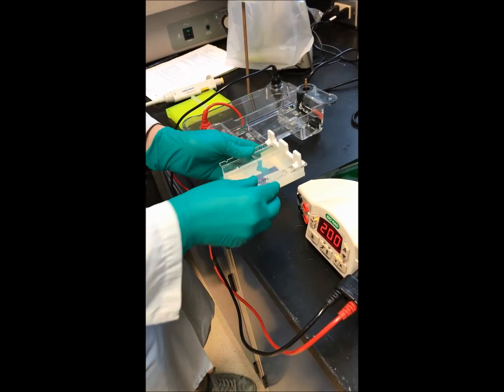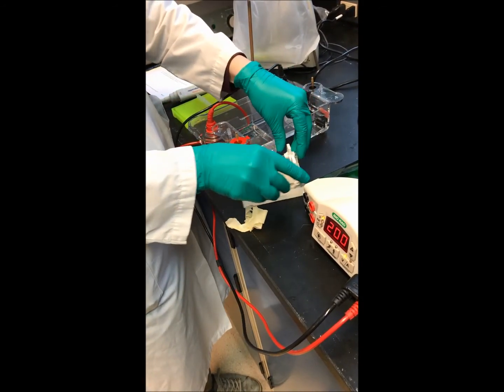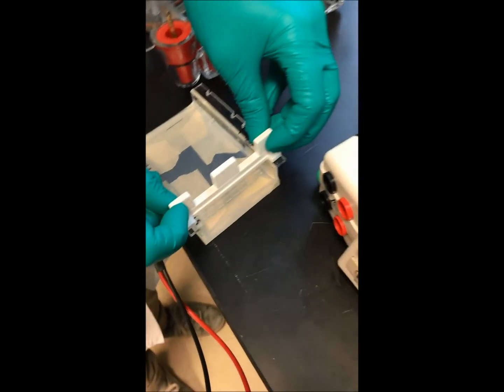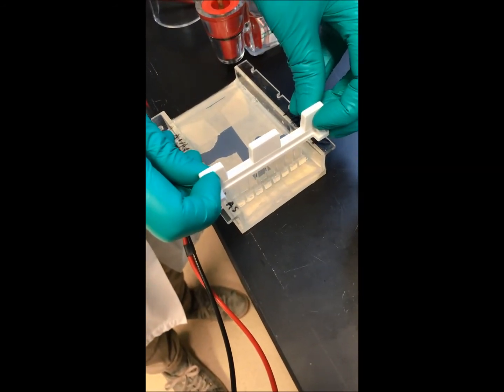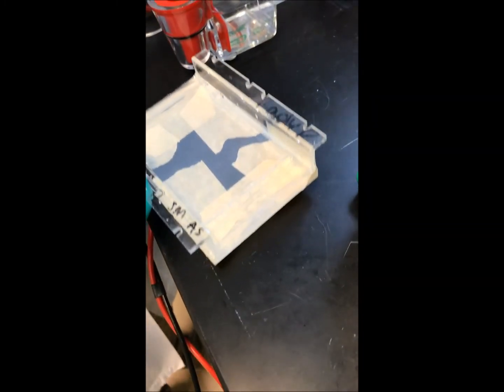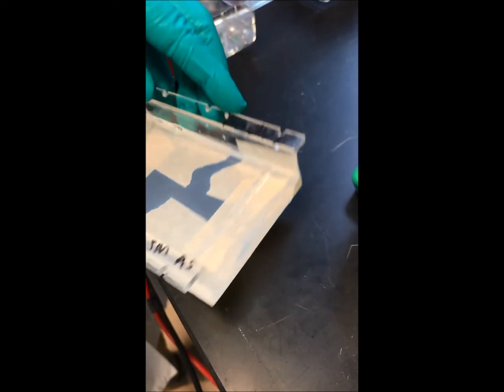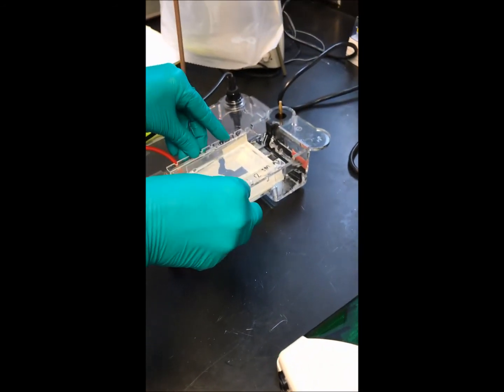And you can also notice that we have a comb here that essentially prepares the wells. Here we have the wells. Remove the comb, the wells, and that's where we're going to place the DNA, the PCR reactions. So we'll place it into the chamber with a buffer.